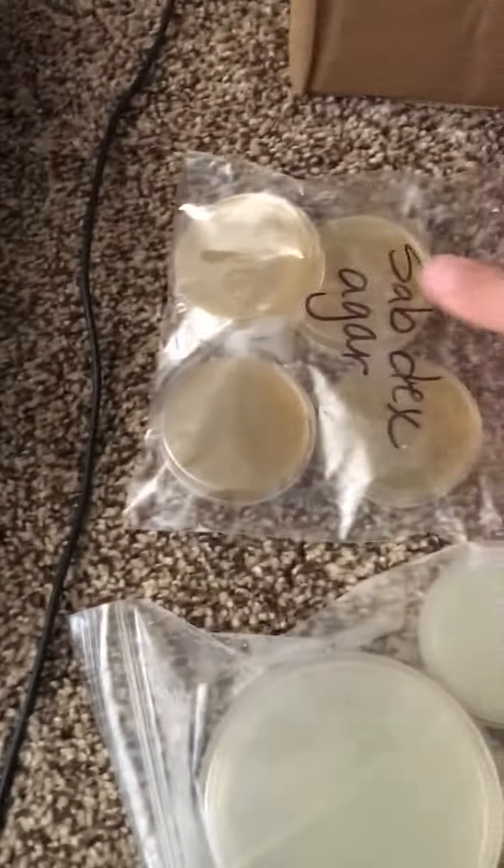You're going to want to take these agar plate bags out of the big ziploc that you're given. There are two of them, and you are going to want to take them and put them in your refrigerator.